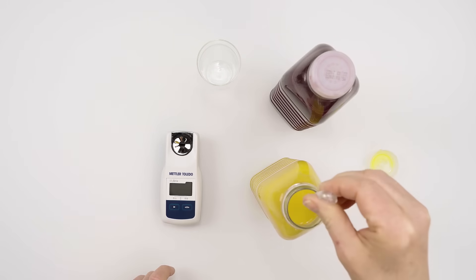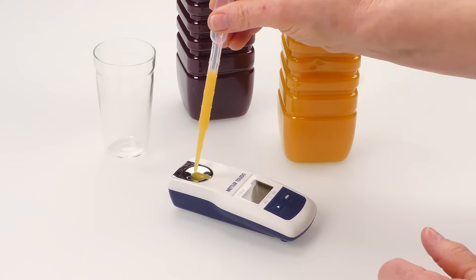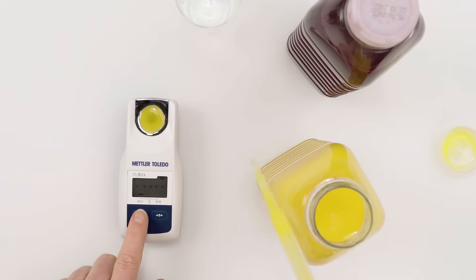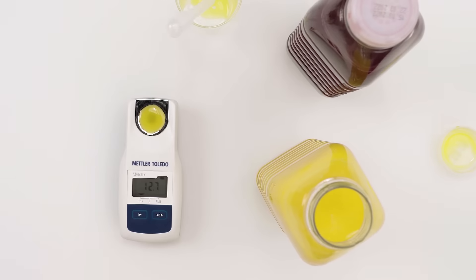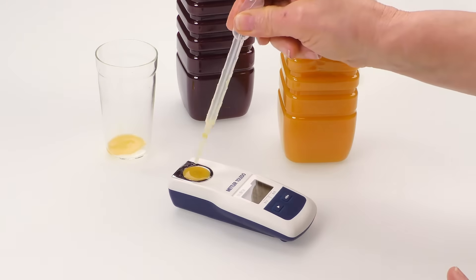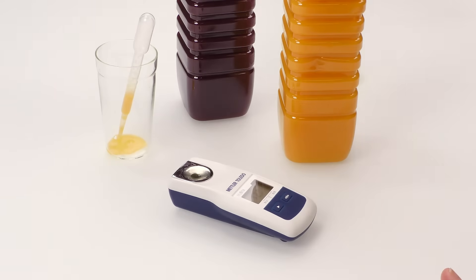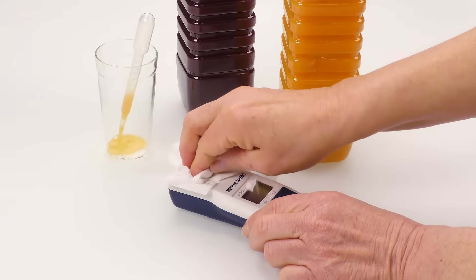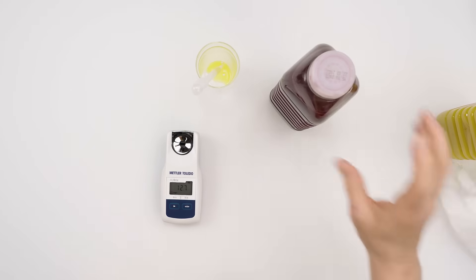Press the read key to turn on the instrument. Cover the prism with your sample, approximately 0.3 milliliters. Press the read key to measure. Remove the sample and dispose of it in the waste beaker. Always remember to clean the instrument with a lint-free tissue in between samples.